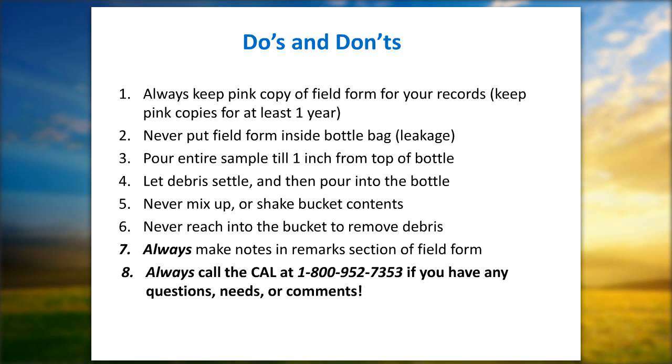For permanent posterity in the database, always make notes in the remarks section of the field form, because when in doubt, we depend on these comments. We might go back to you with questions. You might think you remember something, but it would help to have the comments to help refresh your memory. And then number 8, always call us if you have any questions, needs, or comments. There's also email, ntn@isws.illinois.edu. We should have included that; it is on your field form.